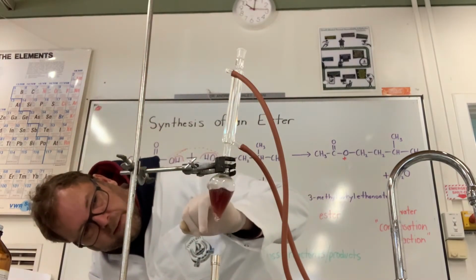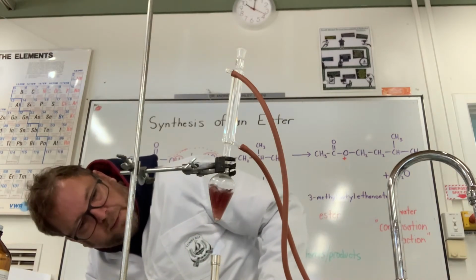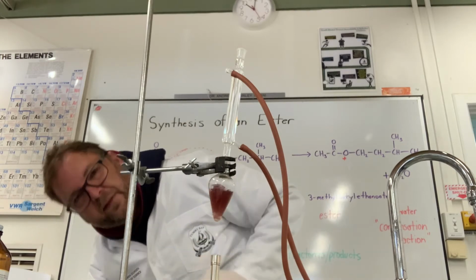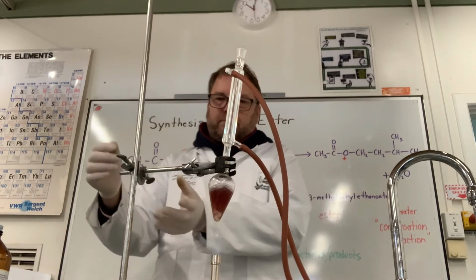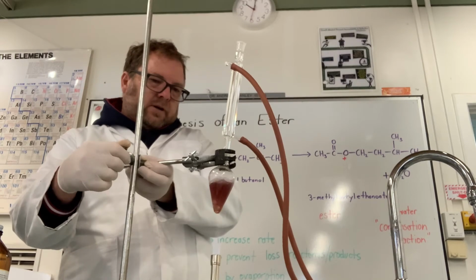And then, they're not quite yet, but in a minute, and I don't know how well you'll be able to pick up on the video, but you'll be able to see basically the reactants running down the inside of that glass there back into the pear-shaped flask.